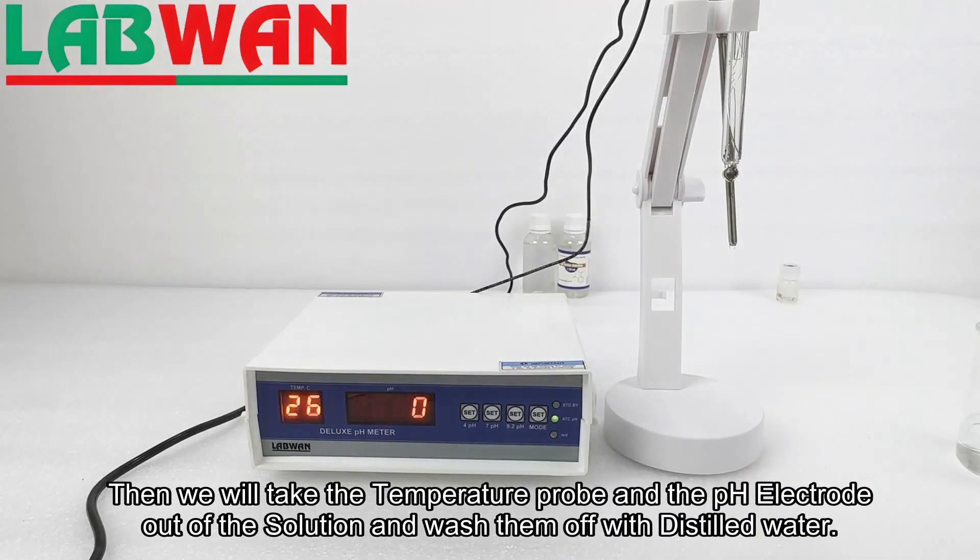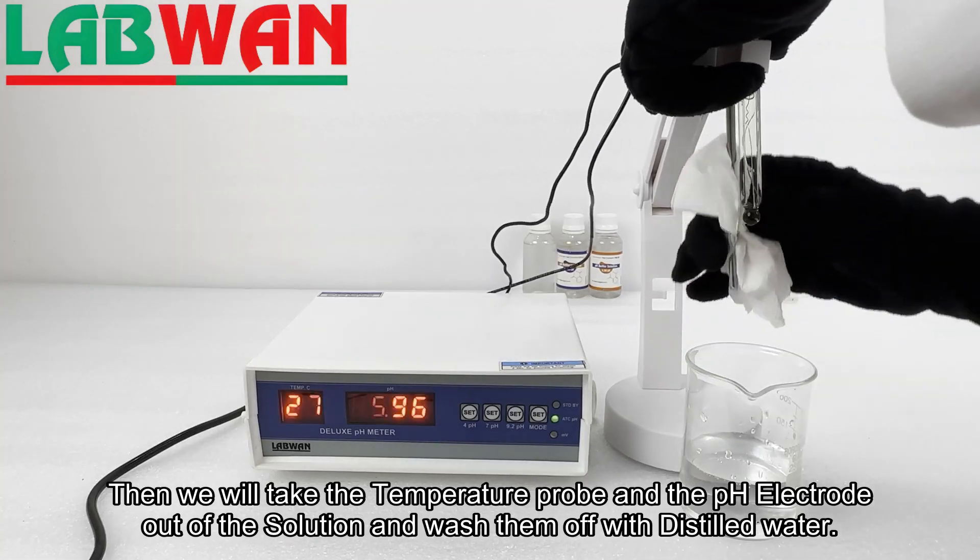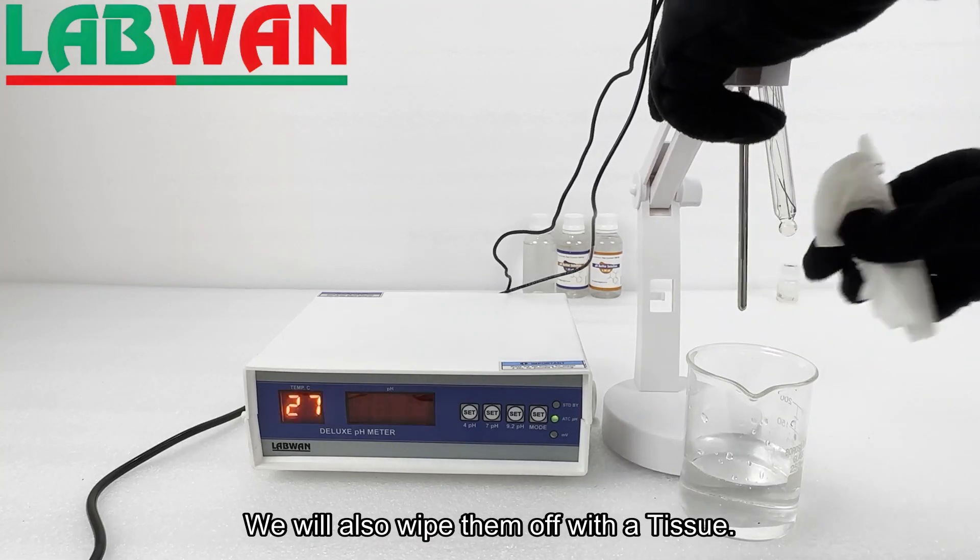Then we will take the temperature probe and the pH electrode out of the solution and wash them off with distilled water. We will also wipe them off with a tissue.